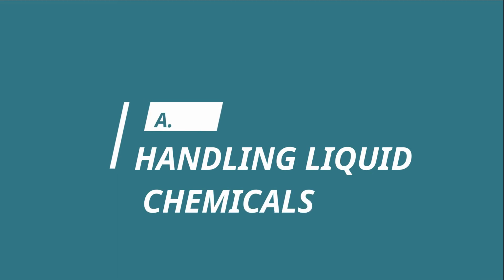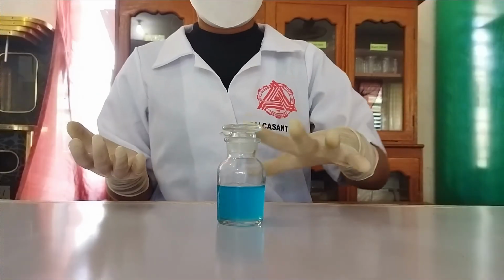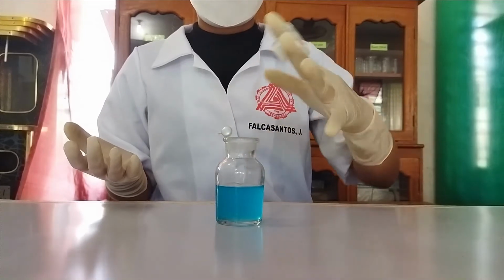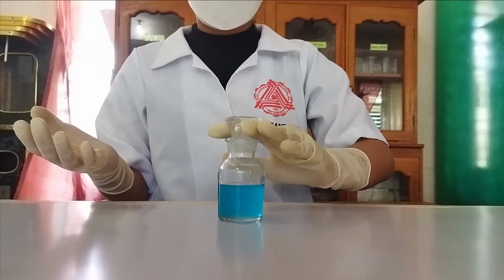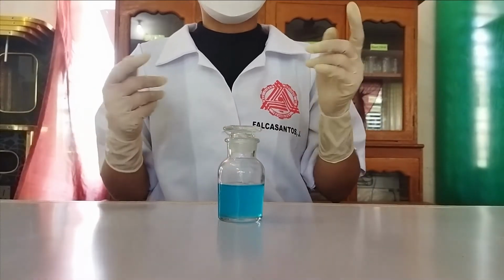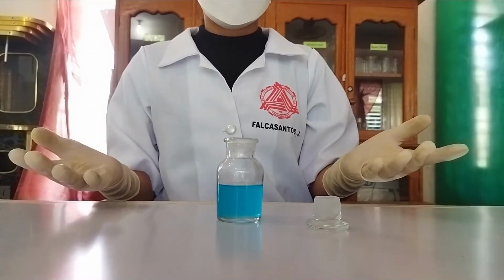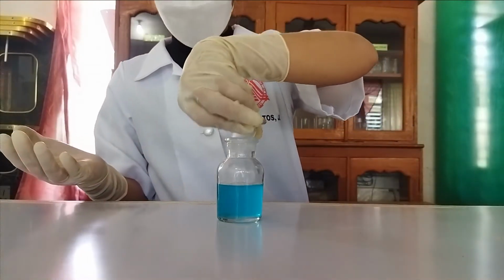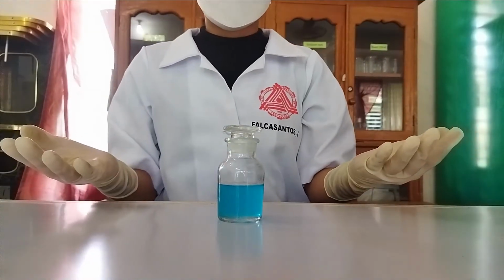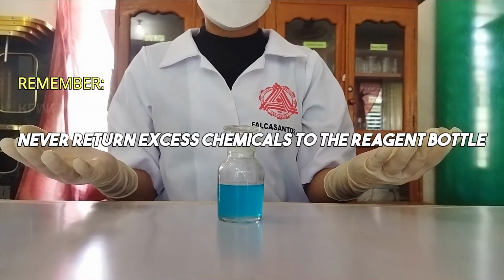Handling liquid chemicals. First, opening a reagent bottle with a glass stopper. Remove the glass stopper by holding it in between the fingers of the hand used to grasp the reagent bottle. You can also do this. Never lay the stopper downward from a reagent bottle on the laboratory bench. Impurities may be picked up and thus contaminate the solution when the stopper is returned to the reagent bottle. Also remember to just pour the amount of reagent you need. Never return excess chemical into the reagent bottle.